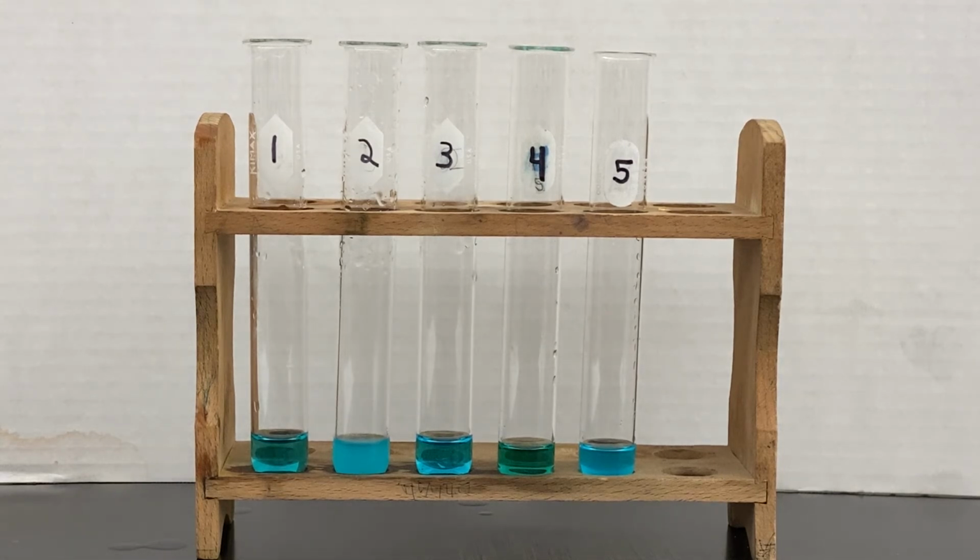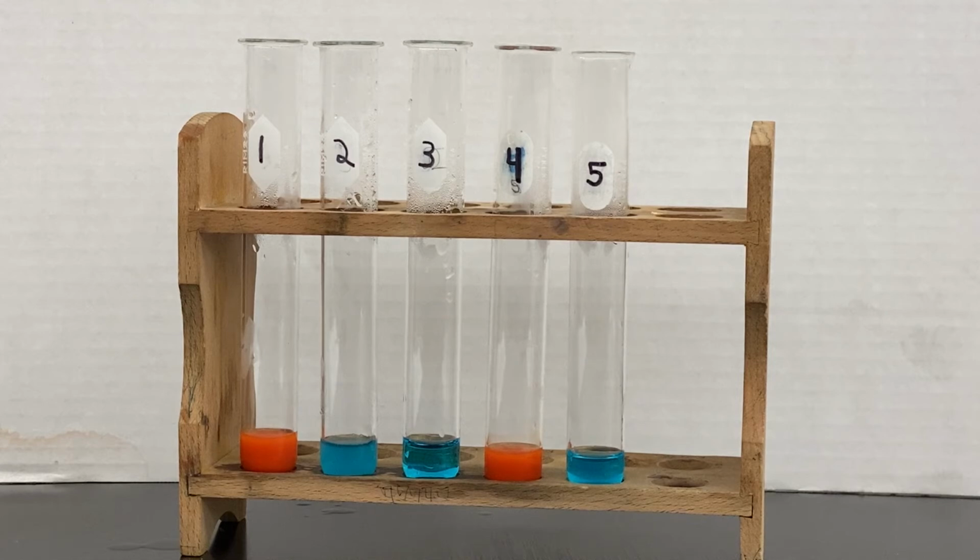All right, so the Benedict's has to now be heated in a hot water bath for 2 minutes. Okay, after having heated each of the 5 test tubes for 2 minutes apiece in the hot water bath, you can definitely see that there is a positive reaction in test tubes 1 and 4. Test tubes 2, 3, and 5 had no reaction and the Benedict's remained blue.